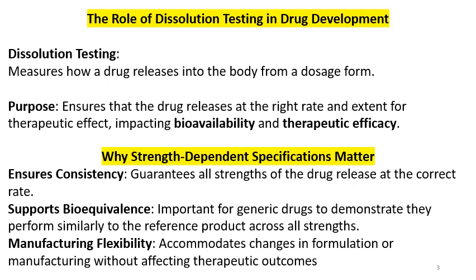Dissolution testing measures how the drug releases into the body from the dosage form. The purpose of dissolution testing is to ensure that the drug releases at the right rate and extent for therapeutic effect, impacting bioavailability and therapeutic efficacy.